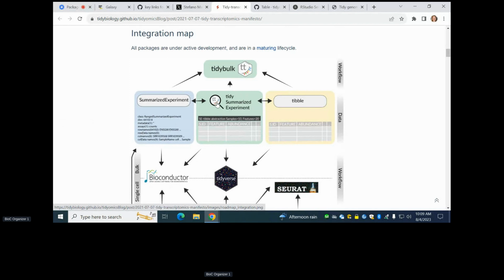In many cases, virtually all cases, you can convert the object, run the same code in terms of manipulation, merging data sets and so on, and it will run. You don't need to, but if you want, you can use the same grammar for all of it. But we want to stress that this is not a replacement for the standard grammar. You can switch between one or the other at your convenience.